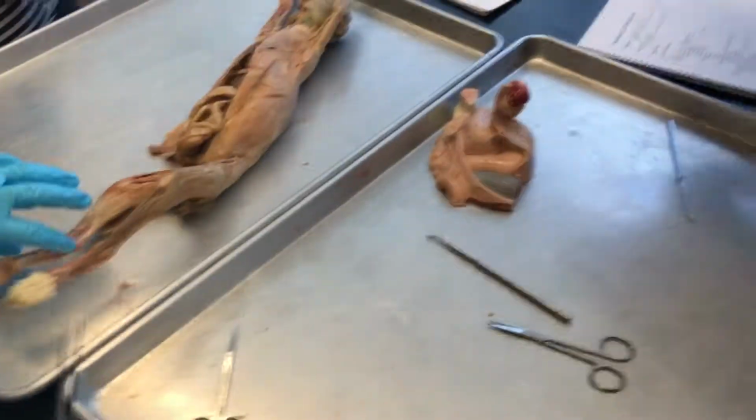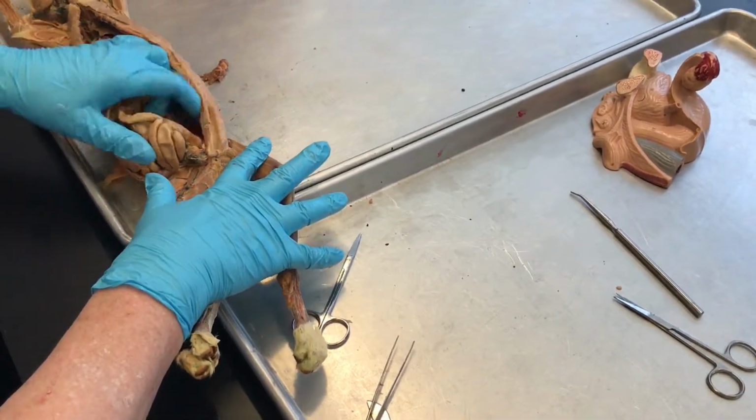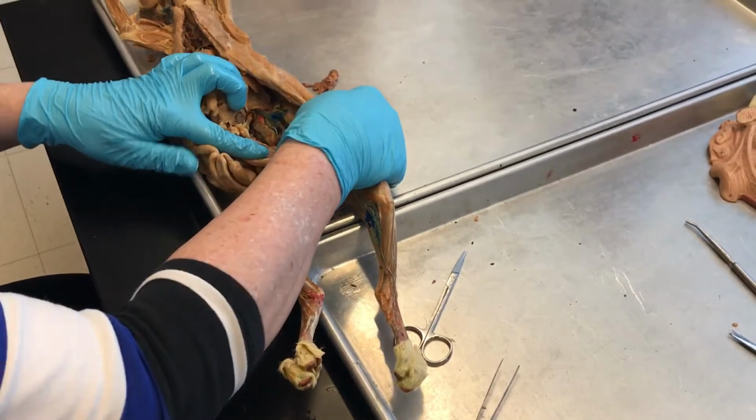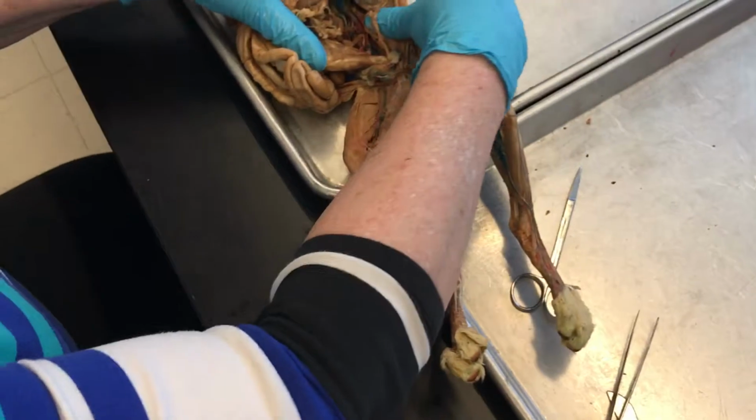Okay, is this our female? Yeah, I believe so. Not very big, but we'll look at her anyway. We found like three males. Okay, here, it's a young female, so that's why she's not very big.